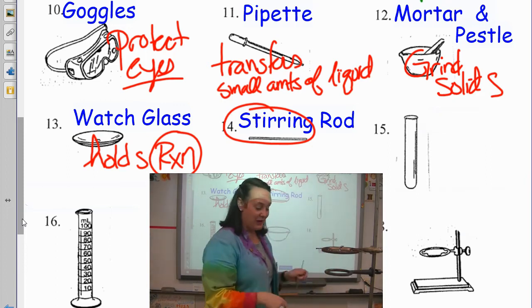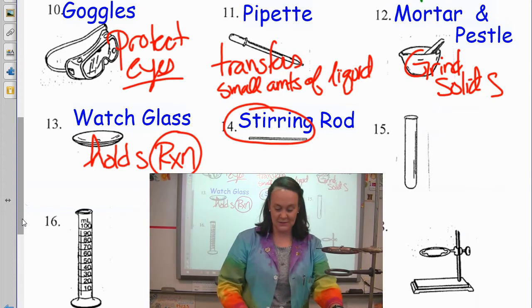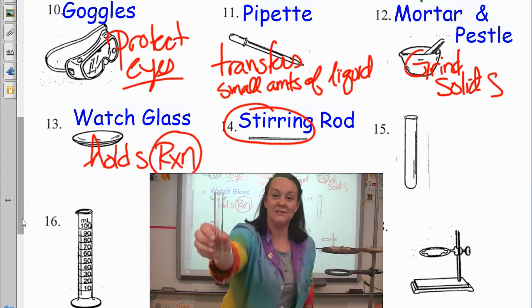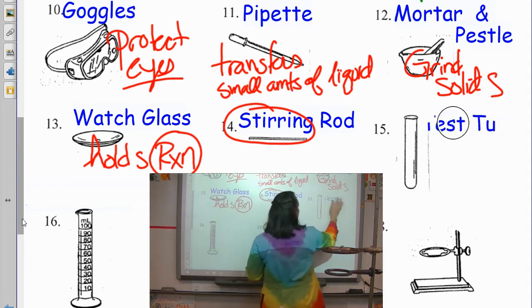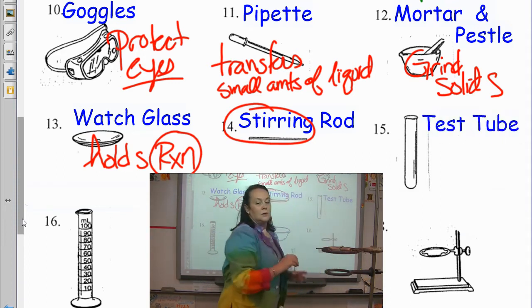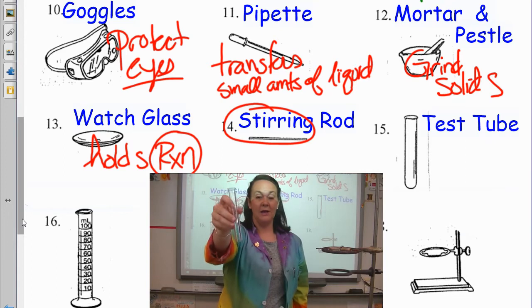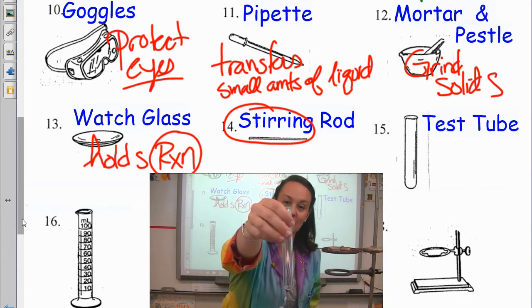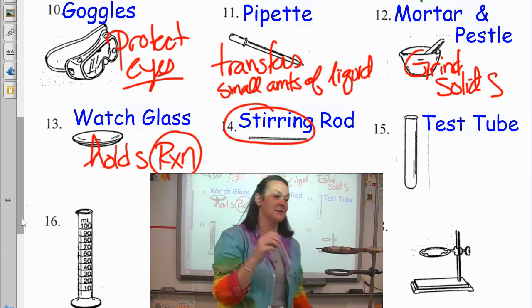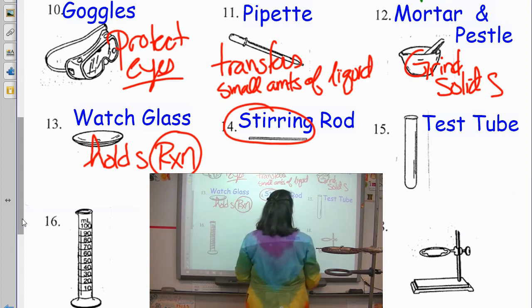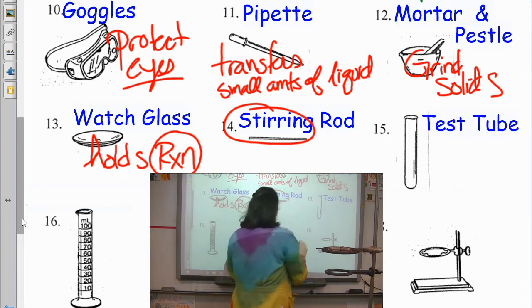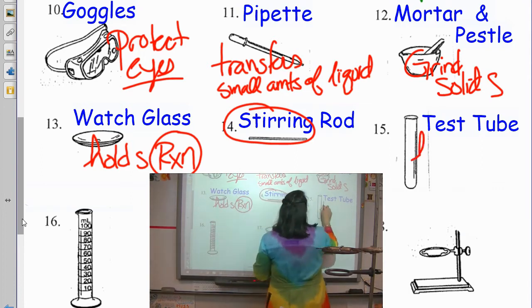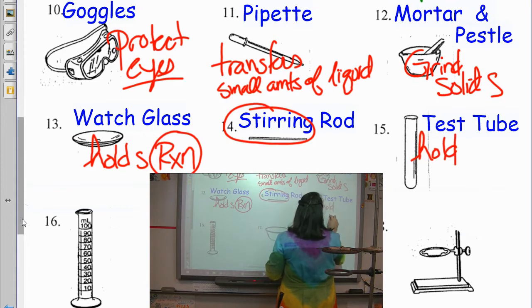Another thing that holds reactions, hopefully everybody knew what these were. This is called a test tube. A test tube. And the test tube, again, not for measuring. There are no incrementations on the test tube. That is not what we want to try to do. So, I would try to trick you on a quiz and say, you know, do you use this to measure? And you'd be like, well, I eyeball. It's about half a test tube. No. Not for measuring. All a test tube does is it holds reactions.